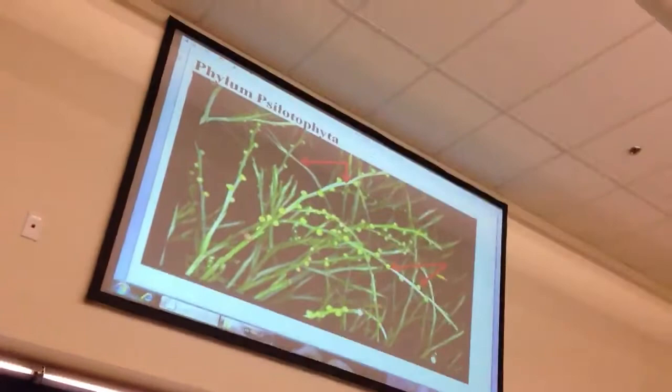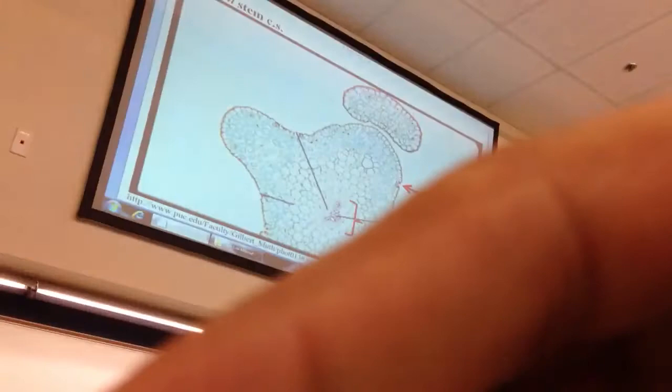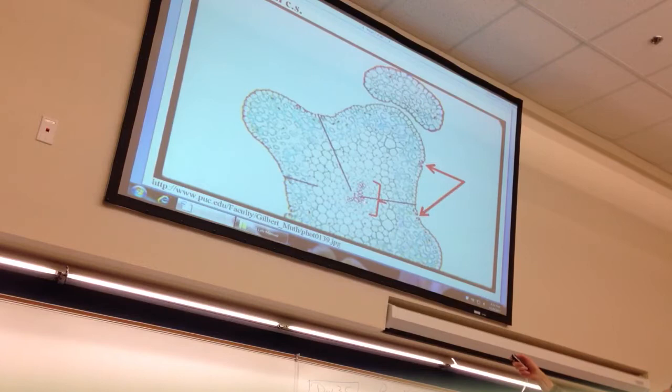This is the plant group that only has stems, vertical and horizontal rhizomes, no roots, no leaves. And if you look at it, just to verify that this is a vascular plant, the whole purpose of this was to see, look at this, that's vascular tissue.